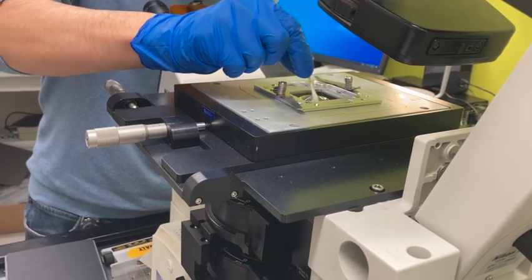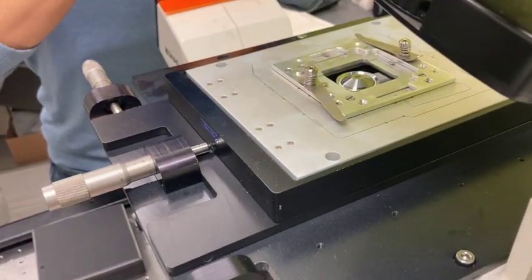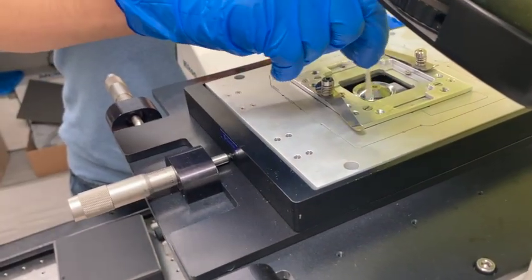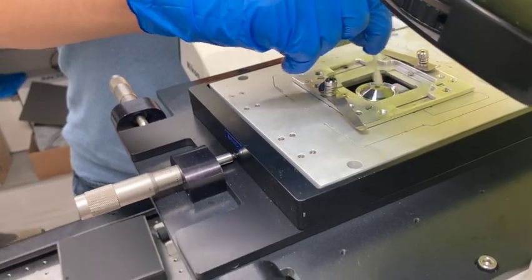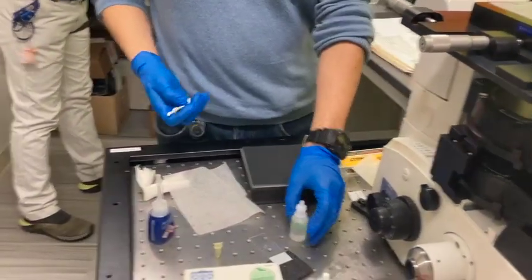And then this ring is designed to collect any oil. So there might be a lot of oil remaining here. So remember to make it clean. And yeah, that's cleaning. Straightforward.